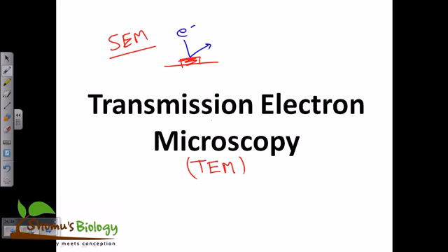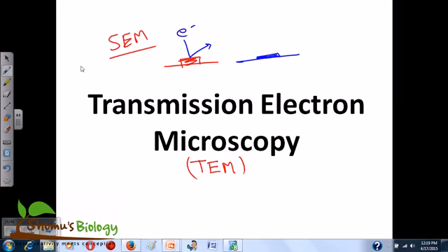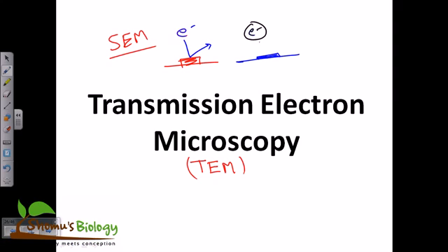But on the other hand, in transmission electron microscopy, the idea here is we have the sample, but remember in this case the sample is very thin, actually an ultra thin sample is required, and the electron that we use will pass through the sample, it will transmit through the sample. This is TEM, because the electron will transmit through that ultra thin specimen, which is very hard to prepare, right? And actually in TEM, the preparation of the specimen is more difficult than the handling of the TEM itself, right?